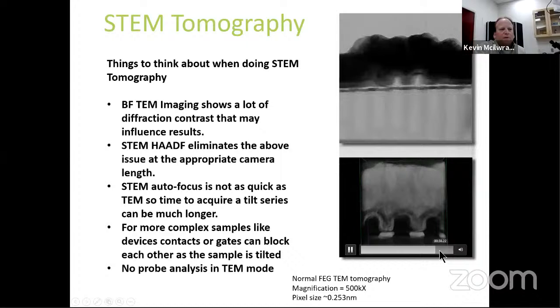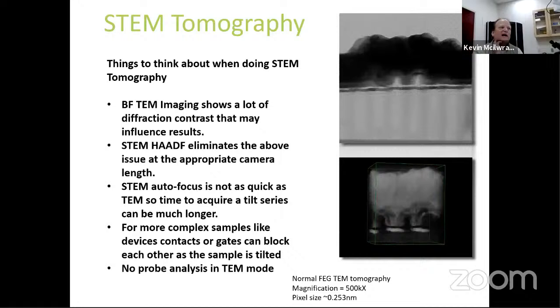We can zoom up and look around this and investigate in three dimensions what's really going on. So if we're going to do STEM, we possibly want to do dark field if there's a lot of diffraction contrast going on. People tend to do STEM dark field tomography, right? So just a quick slide.